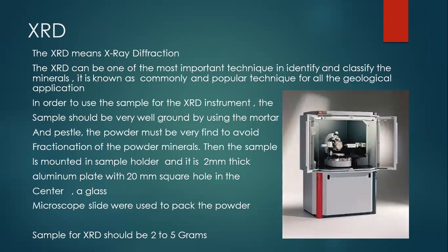So in order to prepare a sample for the XRD, the sample should be very well ground by using what's called the mortar or the pestle. The powder must be very fine. Why should it be very fine? In order to avoid the fractionation of the powder minerals.